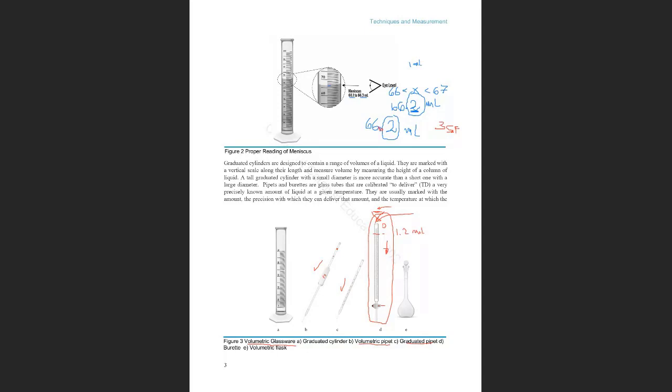So when they give you the data using the buret, you need to know they will tell you the initial volume of the liquid, which is high, it might be 1.2 mL. Then you open this stopcock, put it vertical, and the liquid drains and you pour some, let's say, in a beaker. This is the initial volume, and then it drains, and the marking here is the final volume.